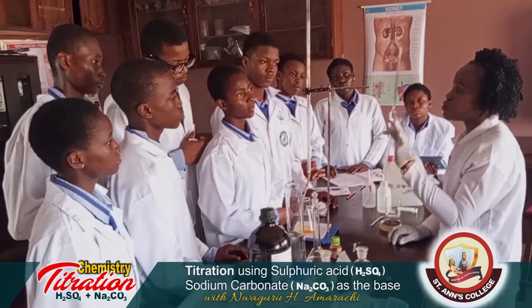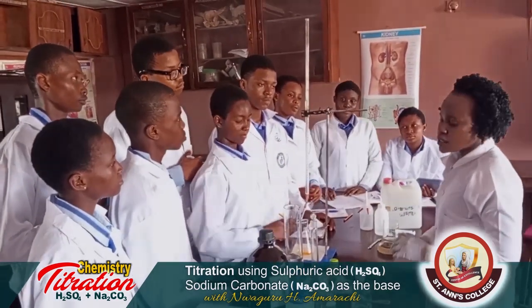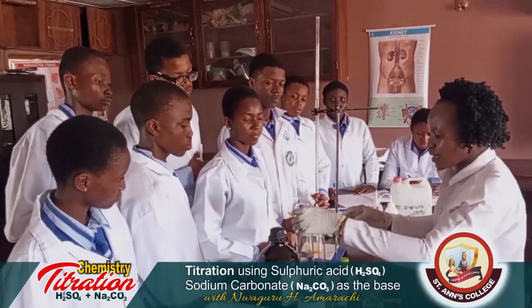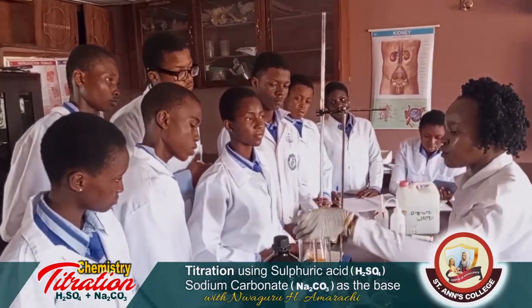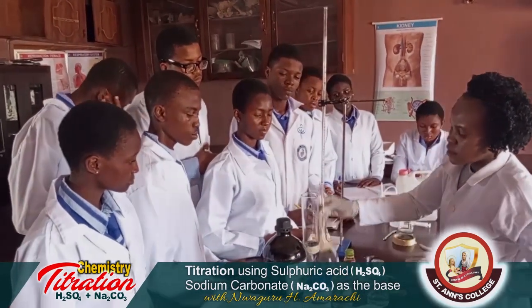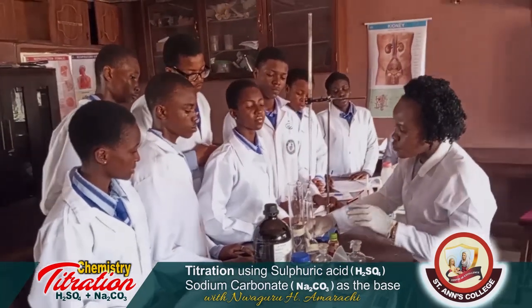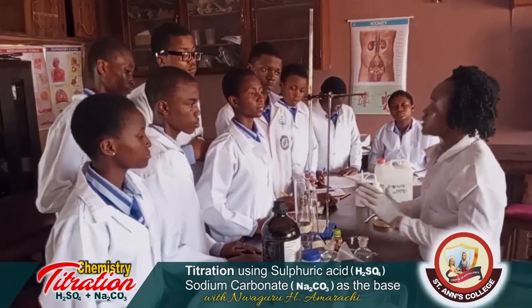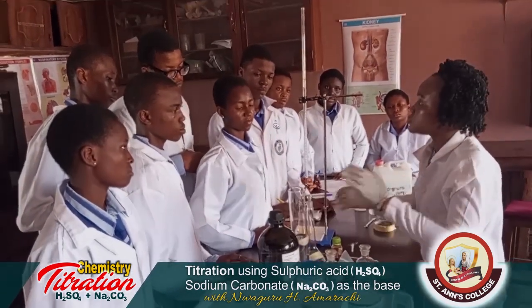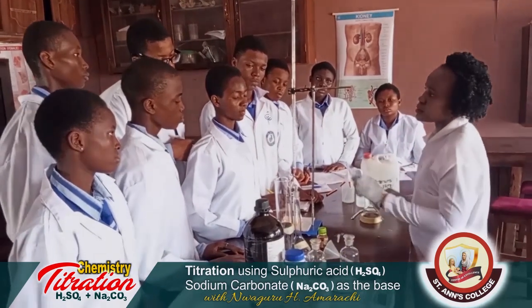For the base, you must use a pipette, and for the acid, you must use a burette. Now, you can substitute, like you can see, we use a 500 ml measuring cylinder for the acid and a 500 ml volumetric flask. If you run a measurement of these 2, you see that they are all the same. So when you talk about substitutes, these are the kind of substitutes you can do. But when it comes to titration, you can't substitute for burettes and pipettes.